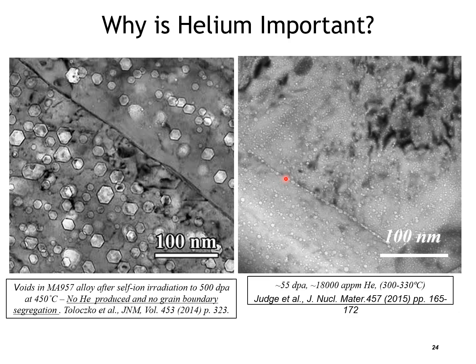So you not only have helium forming, combining with vacancies in the bulk of the material, but you have excess helium segregating at the boundary. So if you can imagine, a helium atom that comes to rest at this location after it's been ejected from a nickel atom and comes to rest as an alpha particle here, it's got a high probability of being absorbed by the boundary.